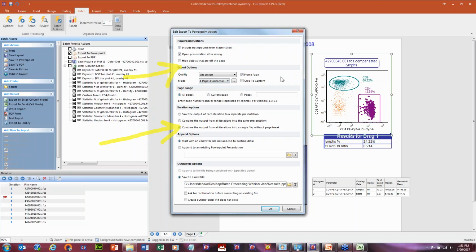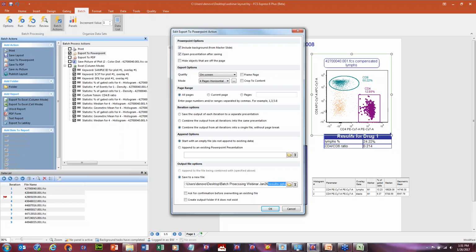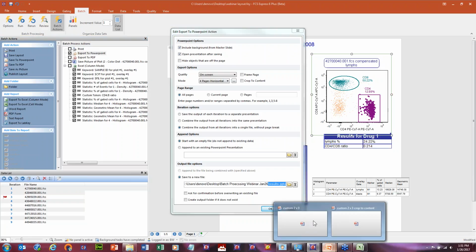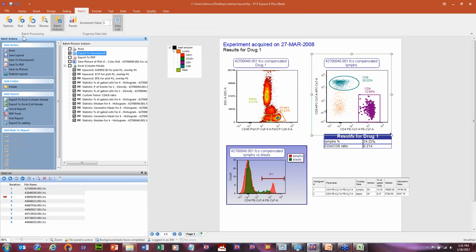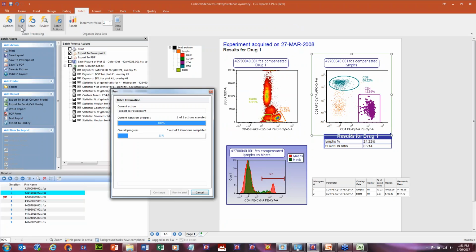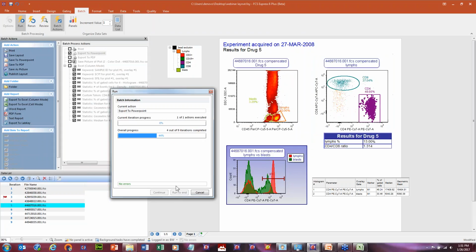Okay, so do you all have any questions? Probably not until I show you, right? So I'm going to click OK. But you know what? Let me give this a new name. Although I think it's fine. Yeah, that PowerPoint's closed, so I should be able to overwrite it. So let's click OK, and I'm going to click Run. Okay, and I'm just going to click Run to End because I'm not going to bother adjusting the gates in this case.